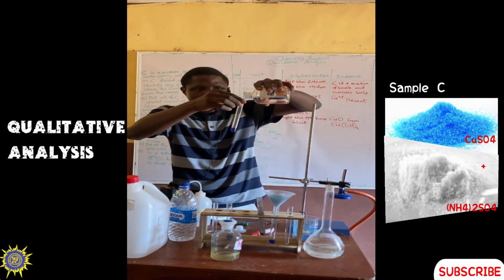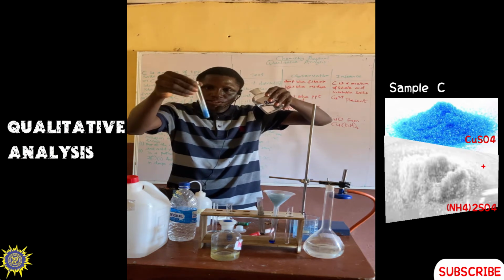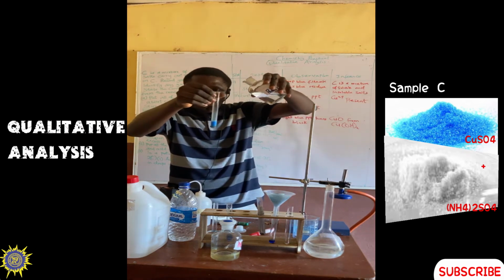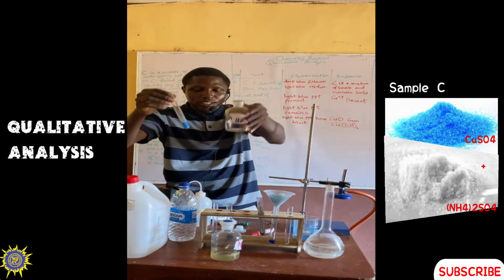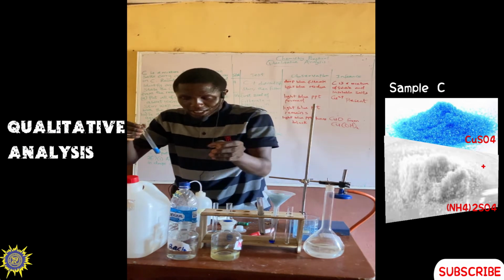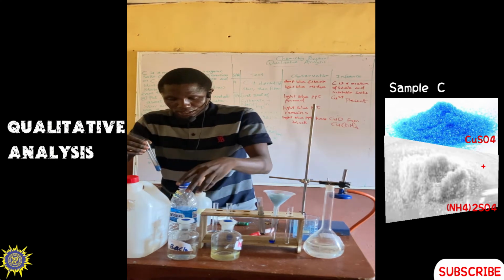Add barium chloride in drops. We have a little bit of precipitate. You see, in drops, you can see it now. Then now let's add HCl to see the changes.